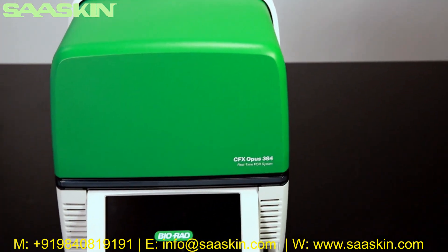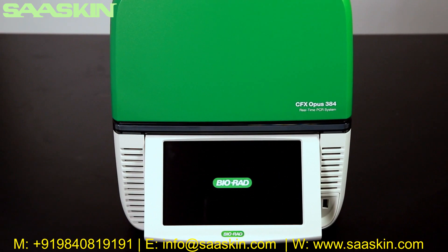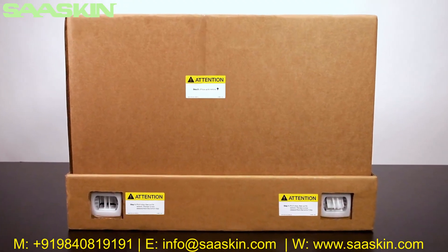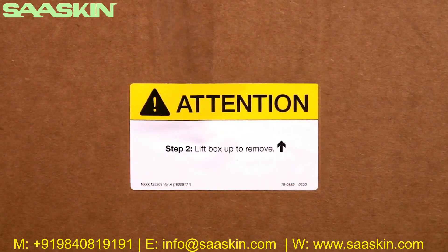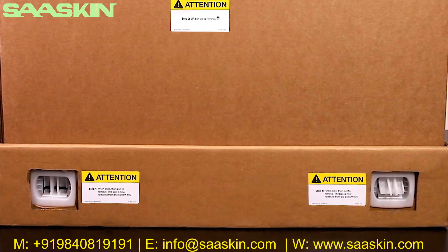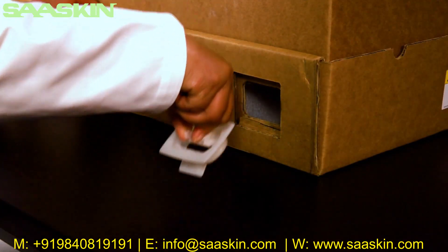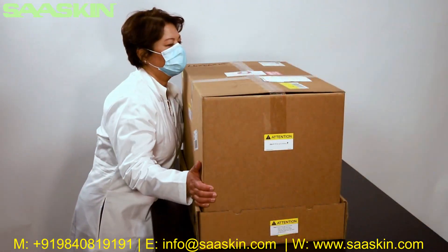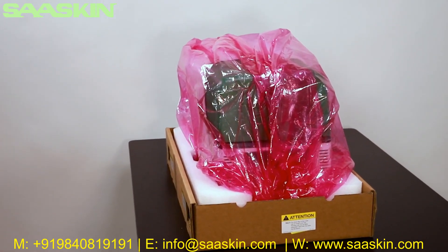Congratulations on the purchase of your new CFX Opus real-time PCR system. The CFX Opus system is designed to be unpacked and installed in minutes. Begin by placing the box on the bench where it will be installed. There are four clips — two on each side — securing the top of the box to the base. Remove them by pinching each clip and pulling it out, then lift the top of the box, leaving the instrument on the cardboard base.